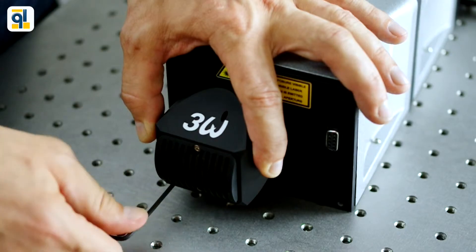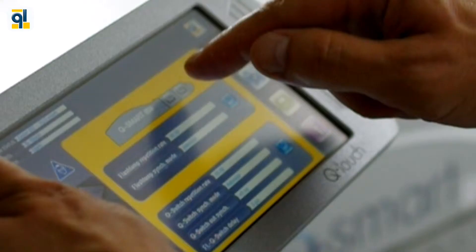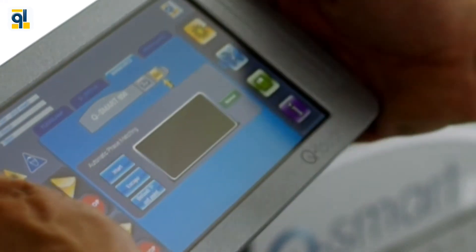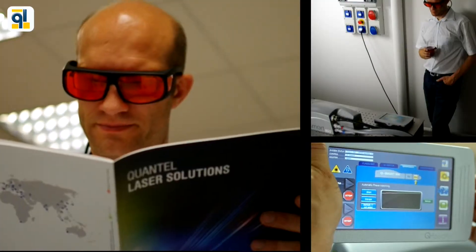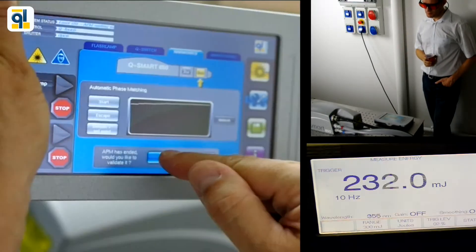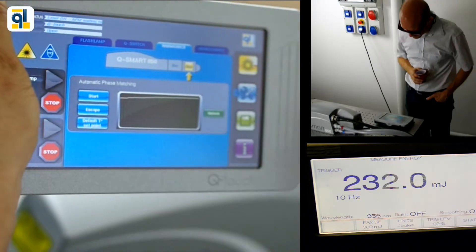Install the third harmonic module, wait for the crystal to be thermalized, and launch the automatic phase matching. While it is running by itself, no need to stay in front of the laser. You can work on your experiment, analyze your data, or even take a coffee.